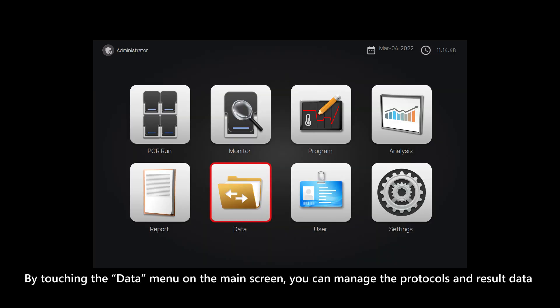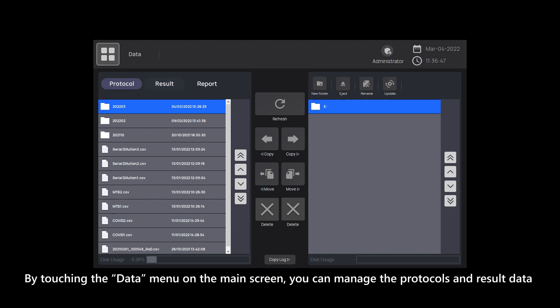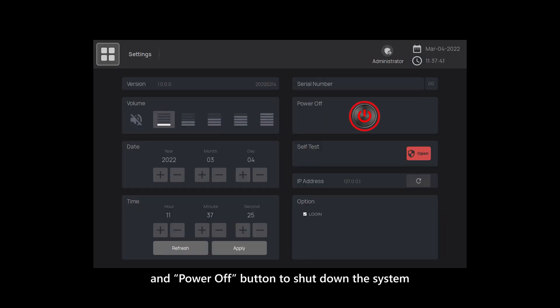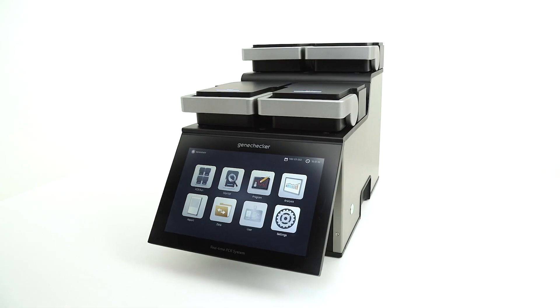By touching the data menu on the main screen, you can manage the protocols and result data. Touch the settings button on the main screen and the power off button to shut down the system.